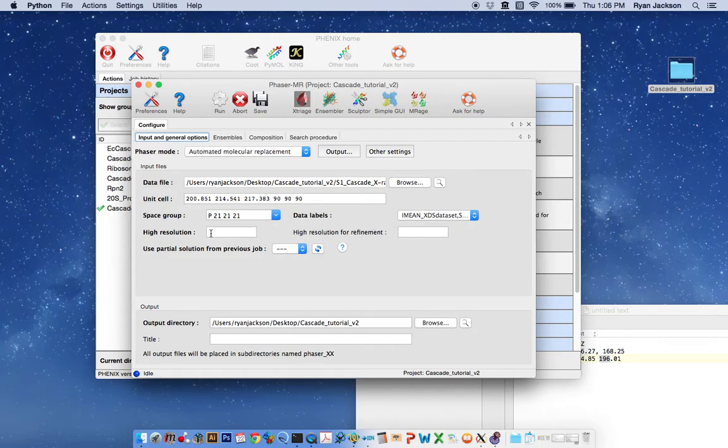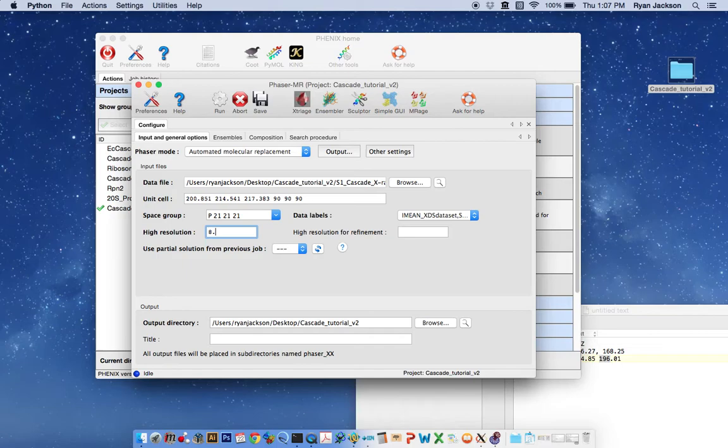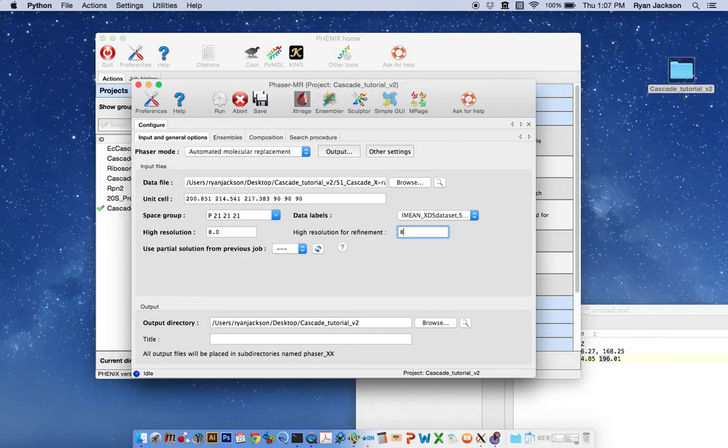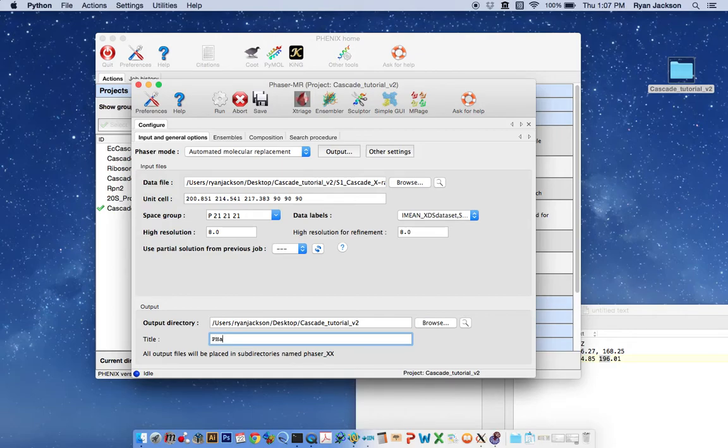The high-resolution and high-resolution for refinement fields, we want to put this as the original resolution limit of the EM map. We want to make sure that the output directory is where we want it to be and we want to find a title of the run.